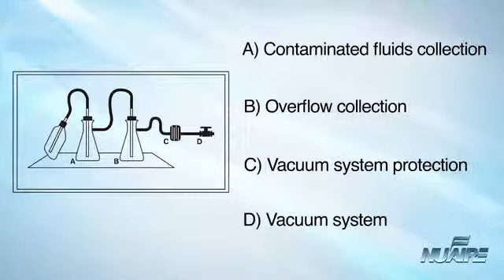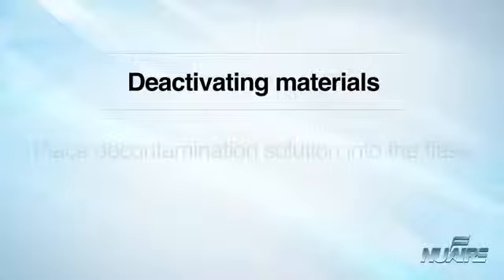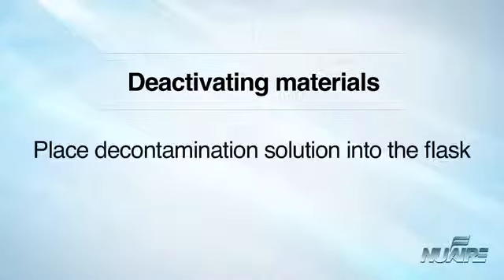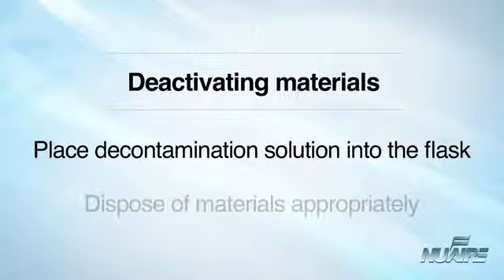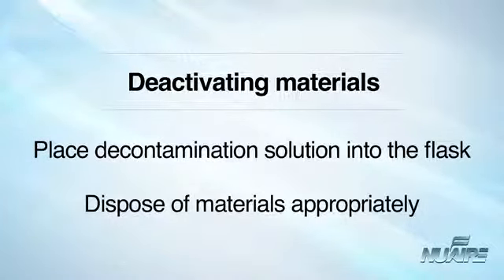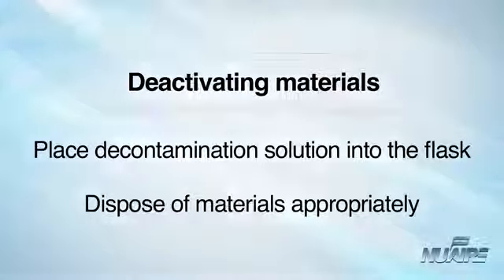This combination will provide protection to the central building vacuum system or vacuum pump, as well as to the personnel who service this equipment. Aspirated materials can be deactivated by placing sufficient chemical decontamination solution into the flask to kill the microorganisms as they are collected. Once deactivation occurs, liquid materials can be disposed of appropriately as non-infectious waste.